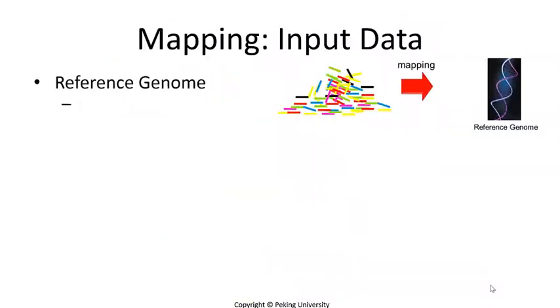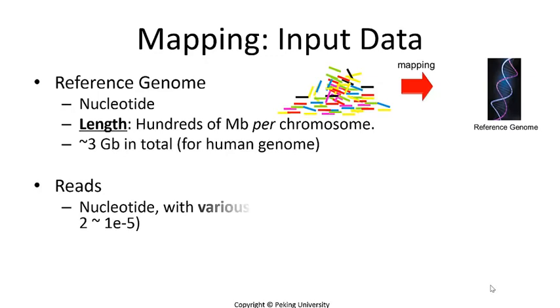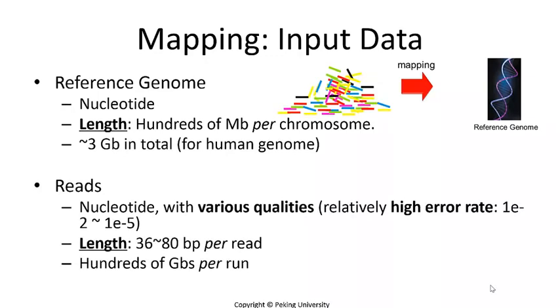In the fifth week, we mentioned that reads mapping is usually the first step of deep sequencing data analysis. Its quality and speed will directly affect the subsequent analysis work. Also, based on the deep sequencing technology, reads generated by RNA-Seq have similar properties with DNA reads generated by genome resequencing in terms of length, quantity, and quality and other aspects.